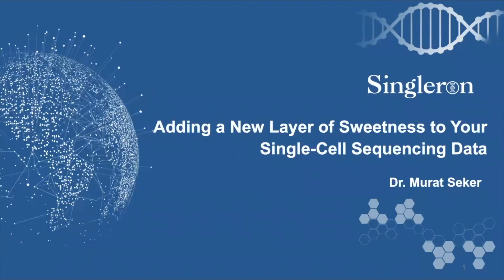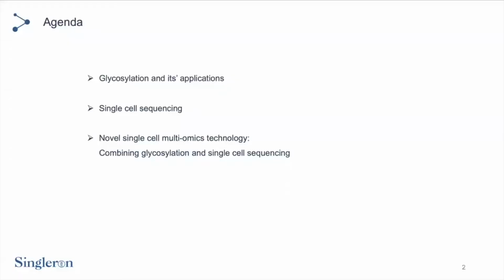The title of my talk is adding a new layer of sweetness to your single-cell sequencing data. And today I'm going to talk about, of course, sweet stuff: glycosylation, glycans, sugars, and its applications, single-cell sequencing, and how we can combine these two in the same experiment.